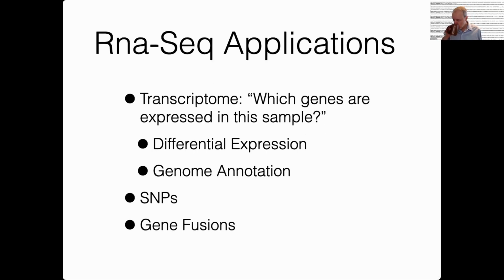I'm guessing everyone here is somewhat familiar with RNA-seq. But just as a quick motivation, I want to talk briefly about a few different ways that it can be used.